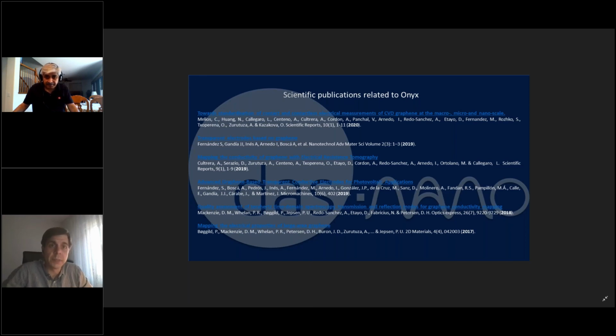As you have seen in the presentation, we have compared a modified version of Van der Pauw. Van der Pauw only gives you a number for the full wafer. What we have done in a collaboration with INRIM is to do a tomography Van der Pauw. So you make a lot of Van der Pauw measurements and extract them up. This is a contact method, but a very well-known method, as you know. And the results with the terahertz signal are very, very comparable. So they are in very good agreement.